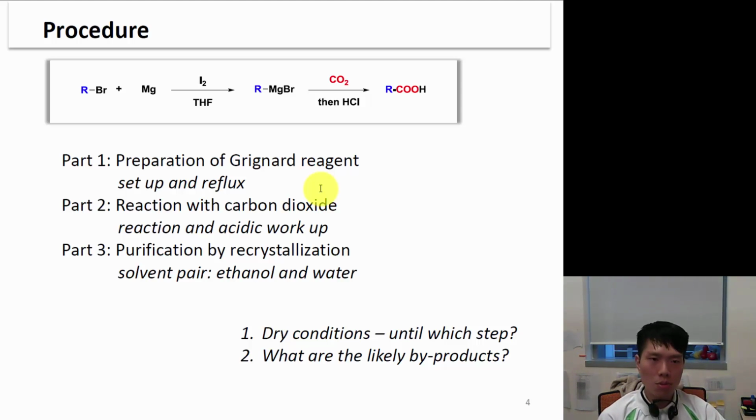And it's also good, before you start the synthetic reaction, to predict what could be the side products that you could get if you're not being very careful, or if you added too much of certain reagent, let's say A or B, and then you may have one in excess. And if you did not allow the reaction to finish, that means you end it prematurely, what could you get instead? Good to think about it.